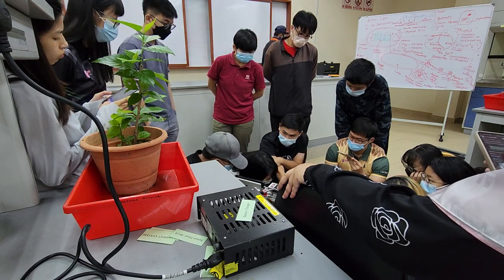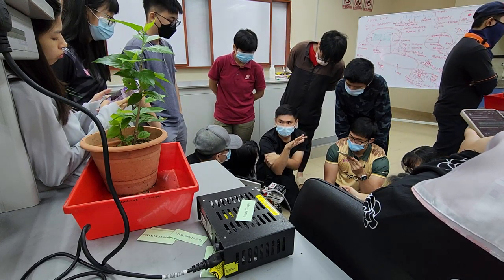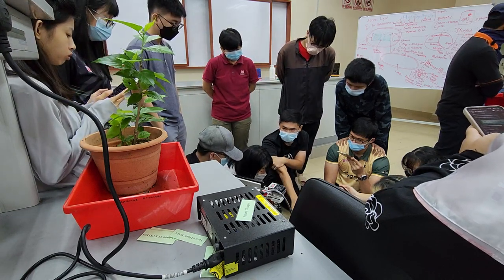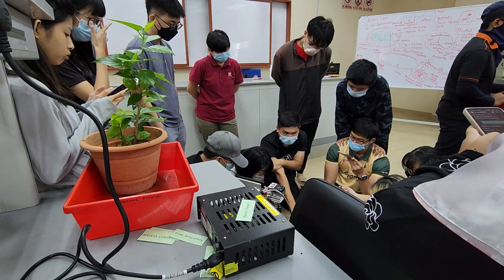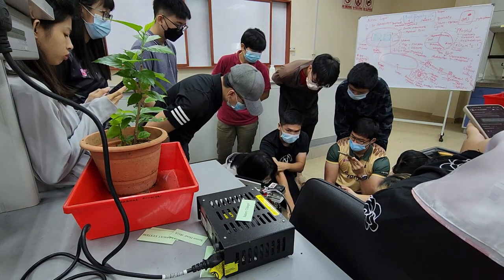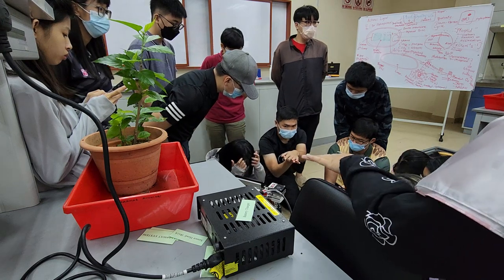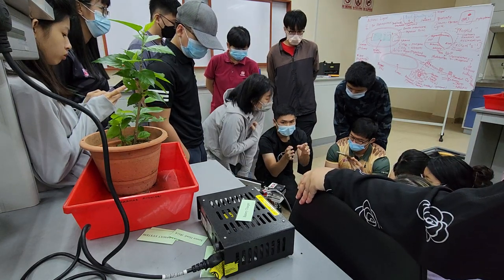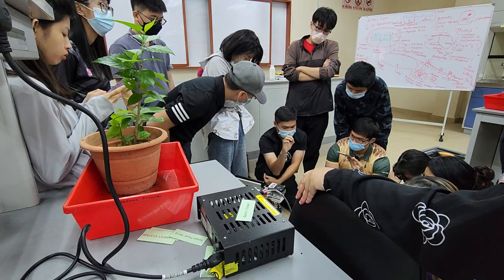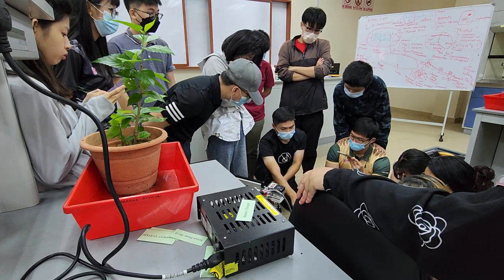So for the CO2 reference, we will set it 400 because the current environment CO2 condition is about 400 now. If in your treatment you want to test 800, you can just change the CO2 reference. So this is the standard environment currently. For all of these parameters, we set the variables here. It is like creating a mini environment within that chamber. Once the leaf is clipped into that chamber with the LED lamp, the leaf is isolated from the outer environment. So any specific treatment you give to the plants will be reflected in this console.